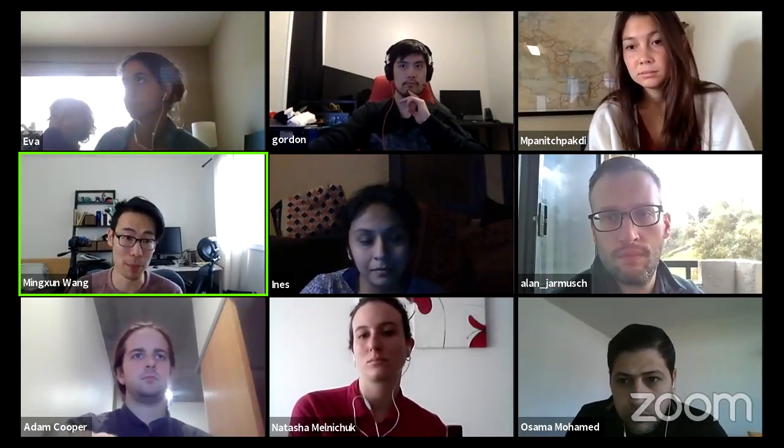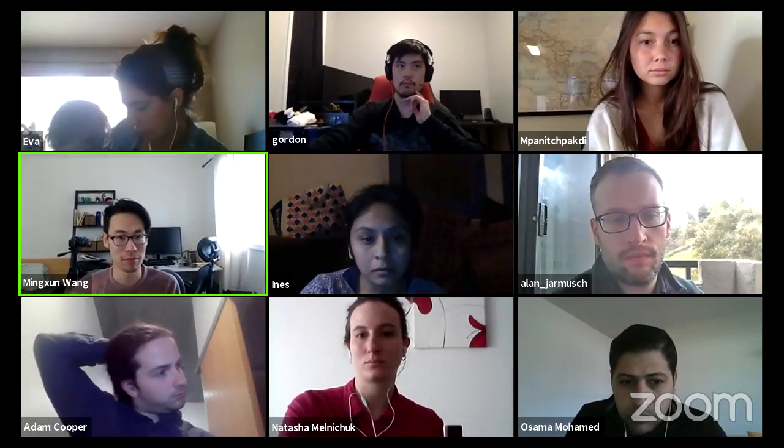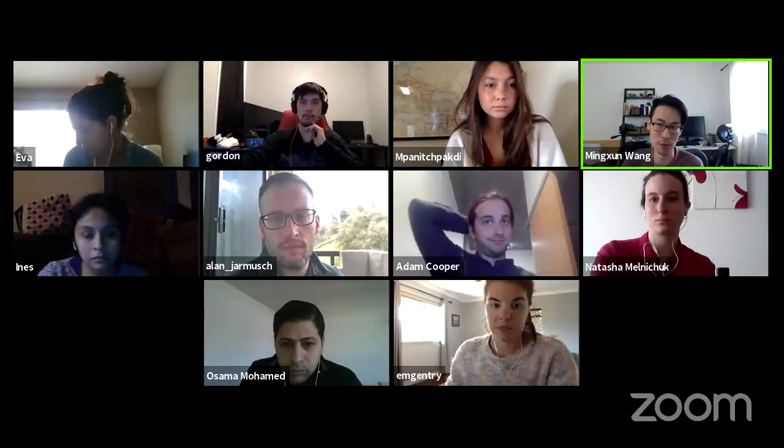In kind of my opinion, you can upload the actual raw data and it should be up to the matching algorithms to clean it up and filter out the noise. That's their responsibility, rather than making a determination upfront on what's noise and what's not.